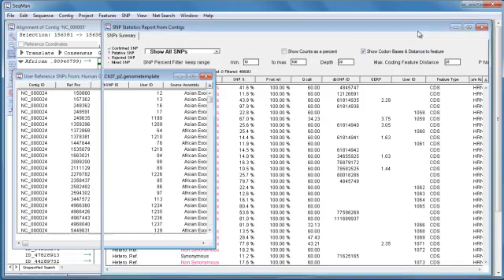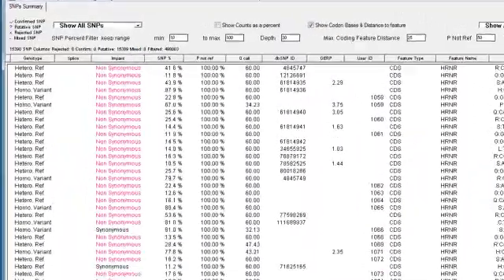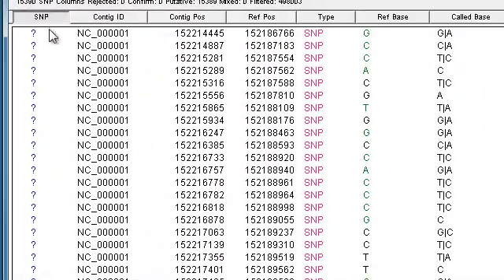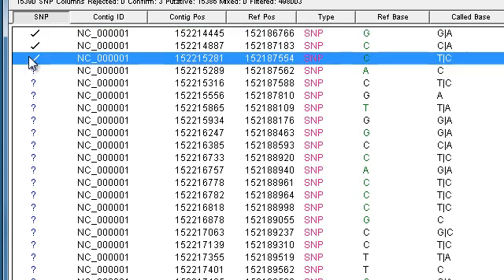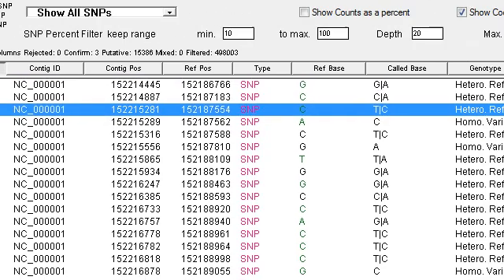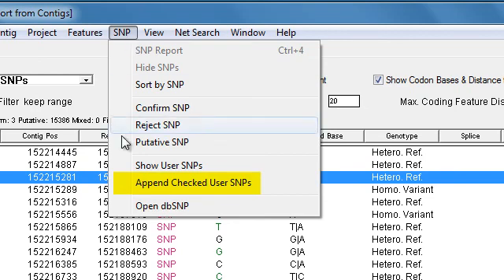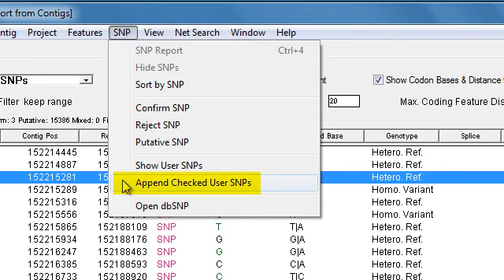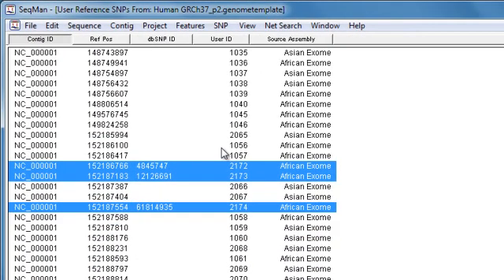I can add to this list directly from the SNP report by checking in the SNP column to confirm these SNPs. And then choosing SNP Append Checked User SNPs. And now you can see my SNPs were added to the list.